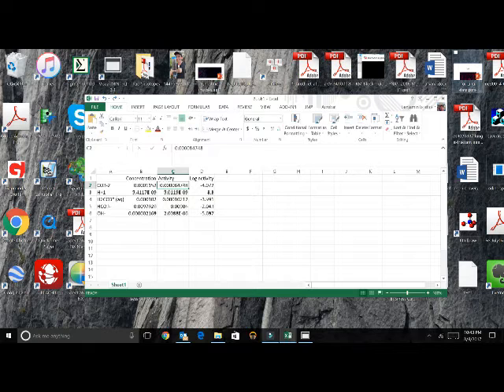And then we have this equilibrated mass distribution, which says for calcium we have this much dissolved at the end after things precipitated, right? And because we allowed it to precipitate, it's a smaller amount than the 3 millimoles we added. In fact, only 3.7% of what we added to the solution as calcium stayed in the solution, and the rest, 96% roughly, was precipitated as that calcium carbonate.